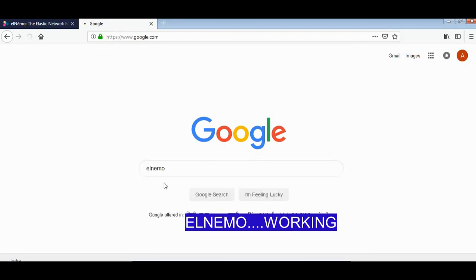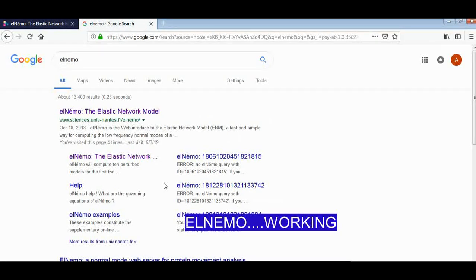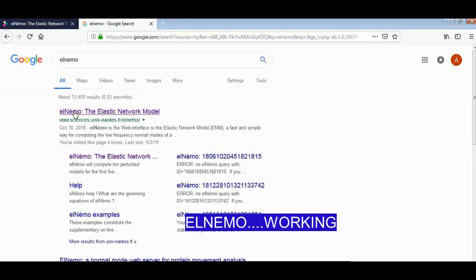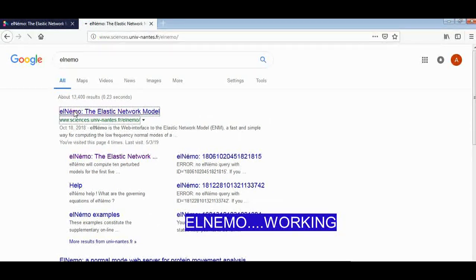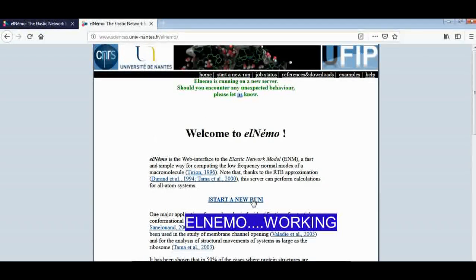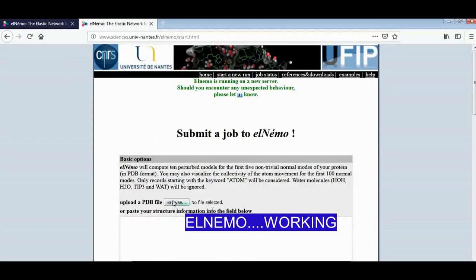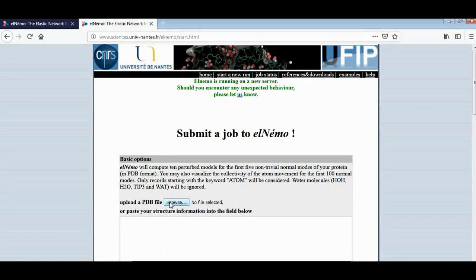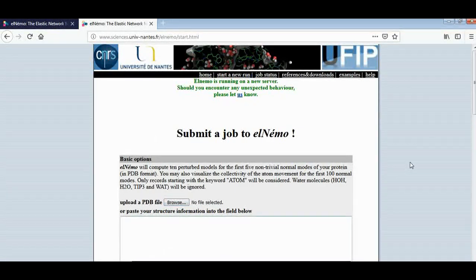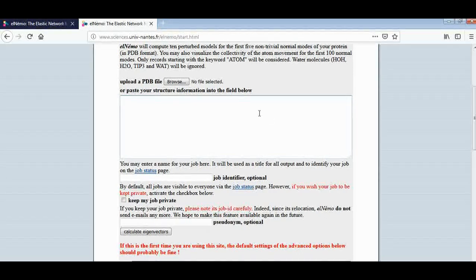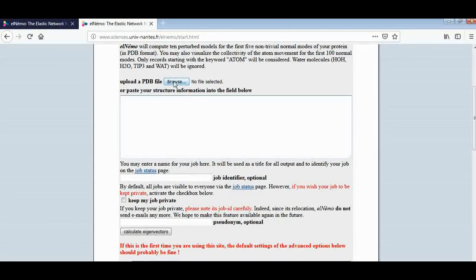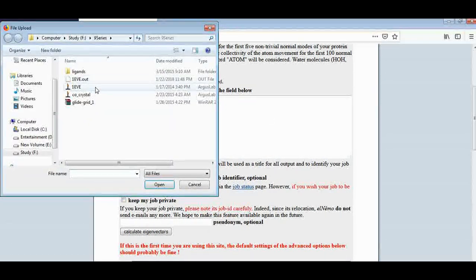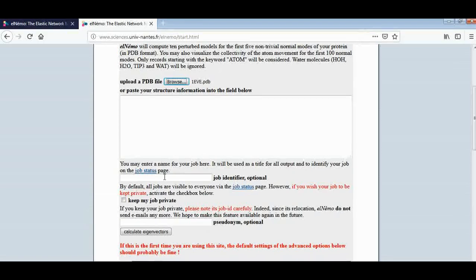ELIMO, the elastic network. Here just start a new run. Here just upload the PDB file or paste structure here. Generally, I would like to upload the PDB file. Just write the - I have written the macro, the job identifier.